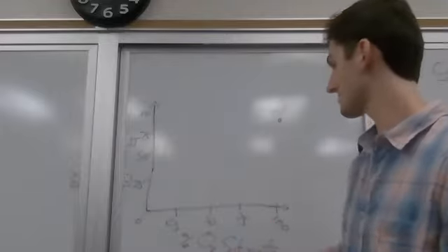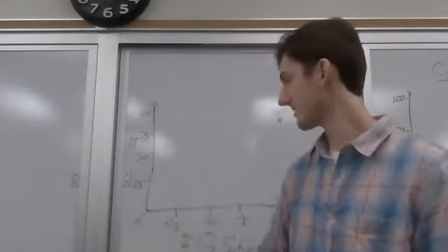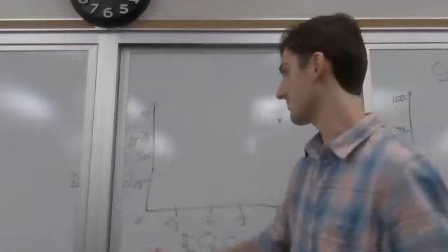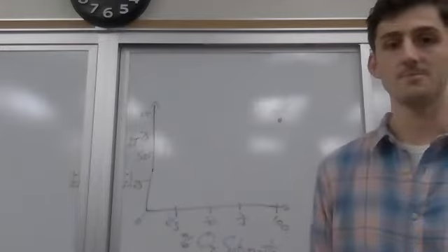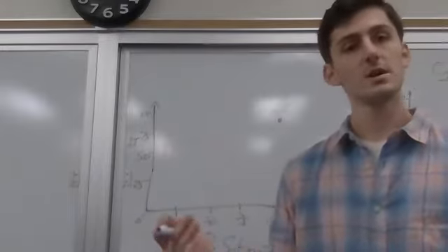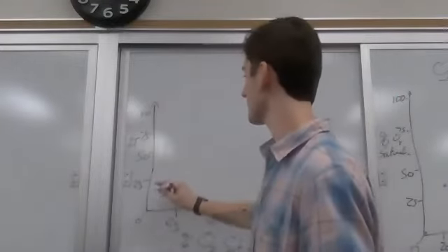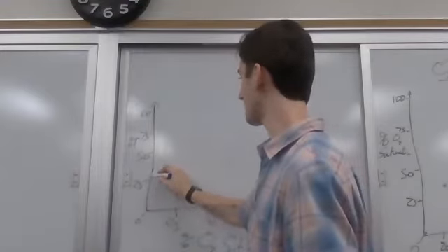We made a second assumption that at a true vacuum, where there's no oxygen left in that volumetric flask, there would be no oxygen left for that hemoglobin. And so at zero partial pressure, we would have 0% oxygen saturation. So we took the transmittance of several values. I believe the average is something like 25.